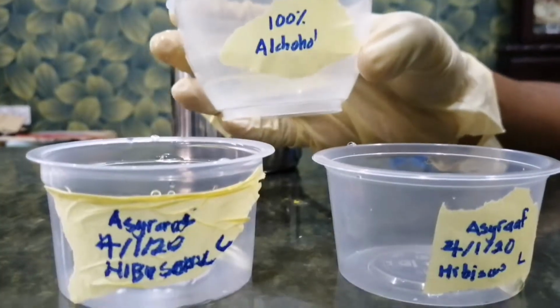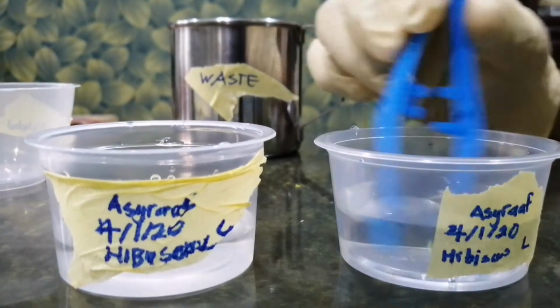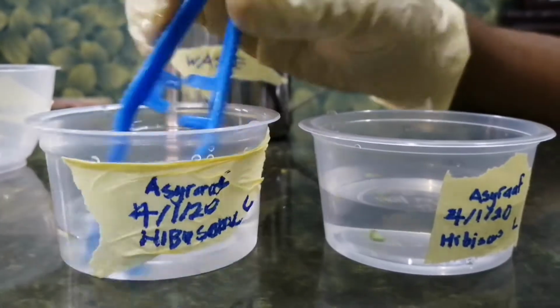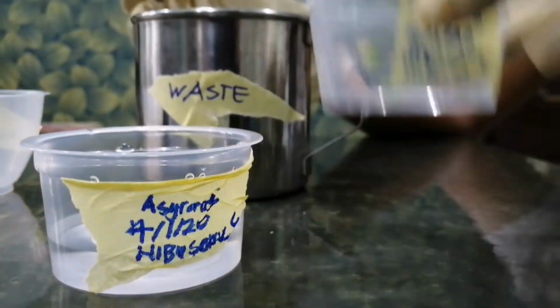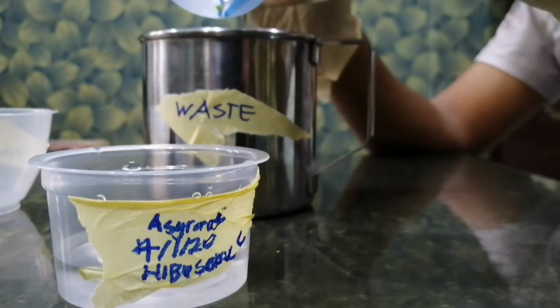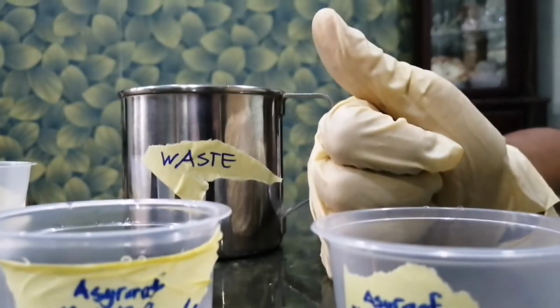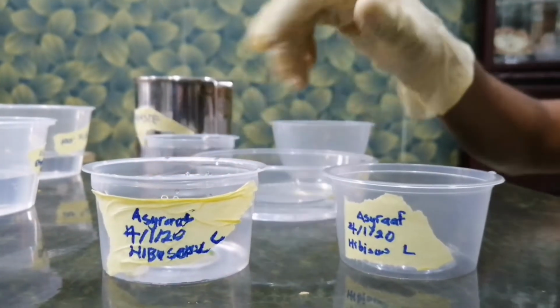For the final part of the serial dehydration, 100% alcohol is added to the specimen and the specimen is immersed for 30 minutes. Then, the 100% alcohol is removed. Okay, now we're done with the dehydration and we will continue with the clearing process.